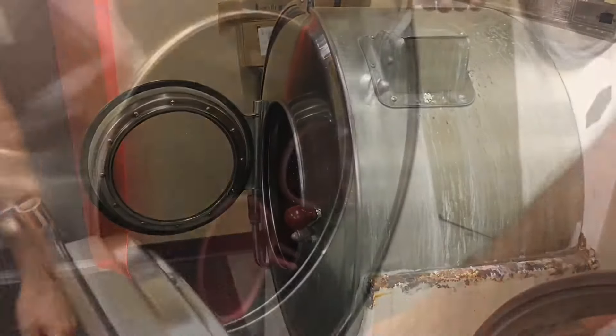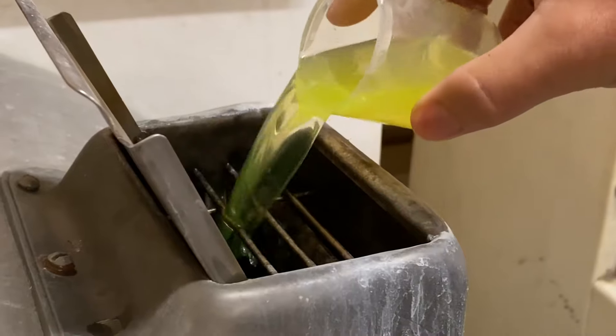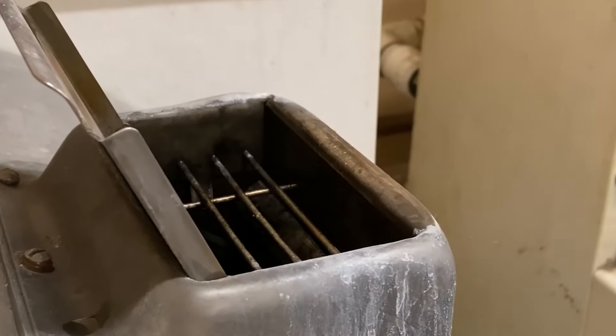Gloves are washed in our commercial washers with detergents that disinfect and remove contaminants. These detergents are proven safe for industry use on rubber protective equipment.